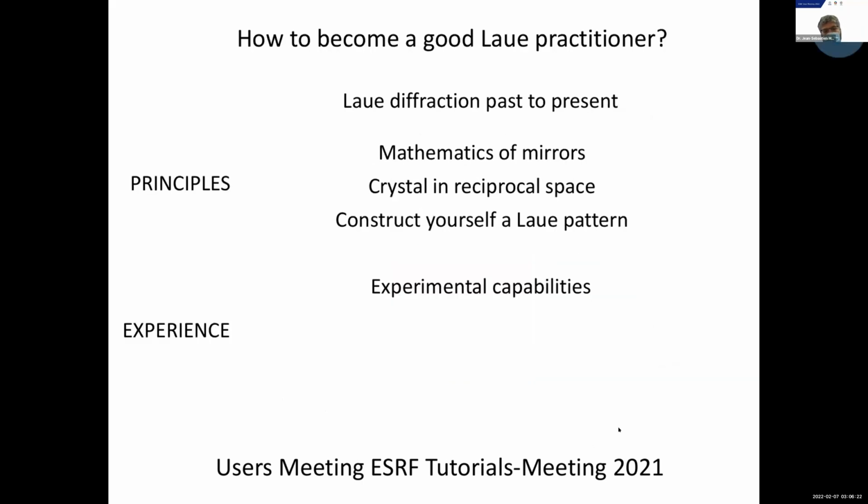Okay, so how to become a good Laue practitioner? You will need to know a bit of mathematics, but it will be simple mathematics, just to explain what a reflection is and what the geometry is, which is related to how we can express the reflection onto a plane, simply like that. I think most of you know what reciprocal space is. So I will just show you the schematics we need to understand the Laue pattern.